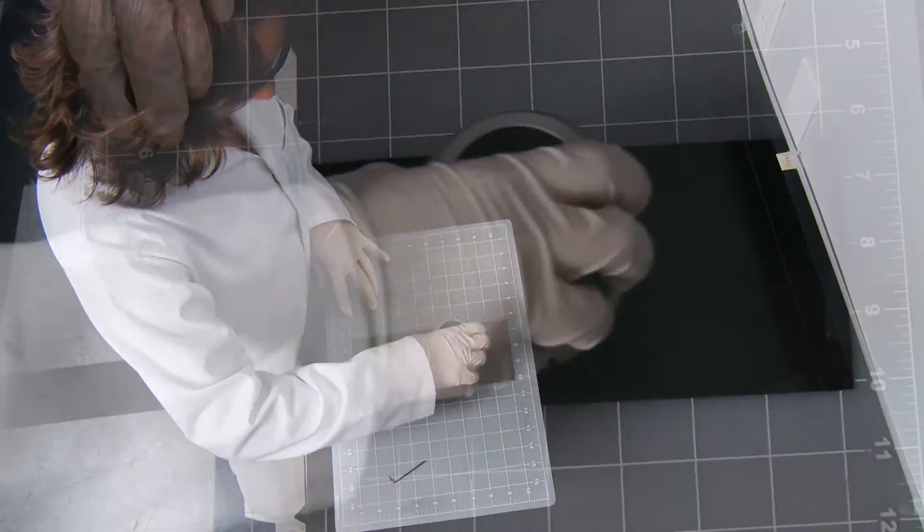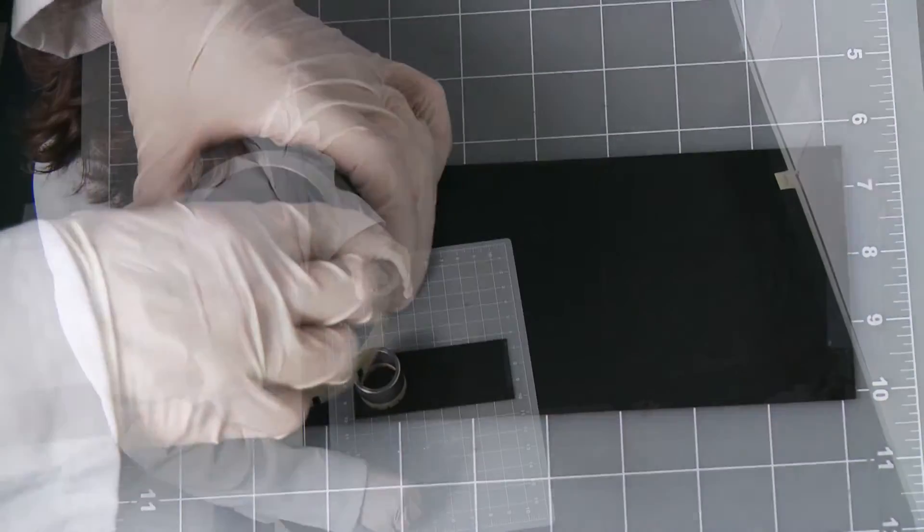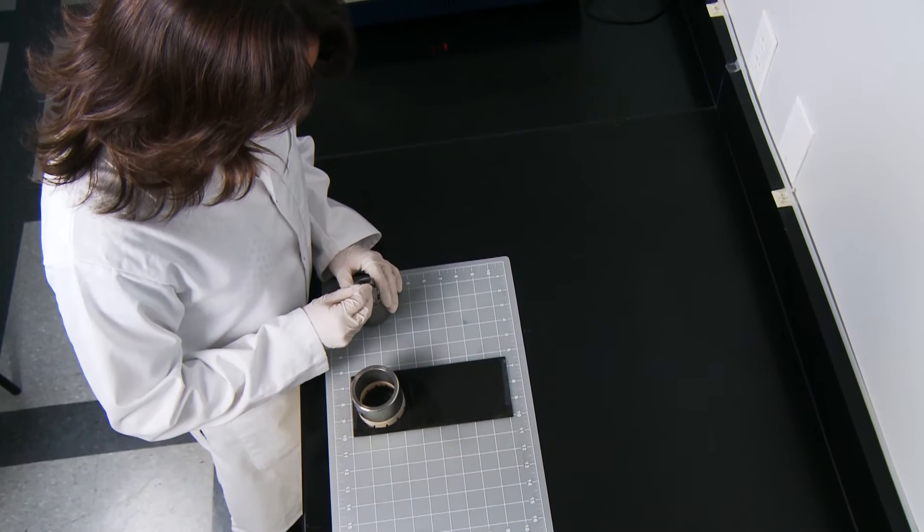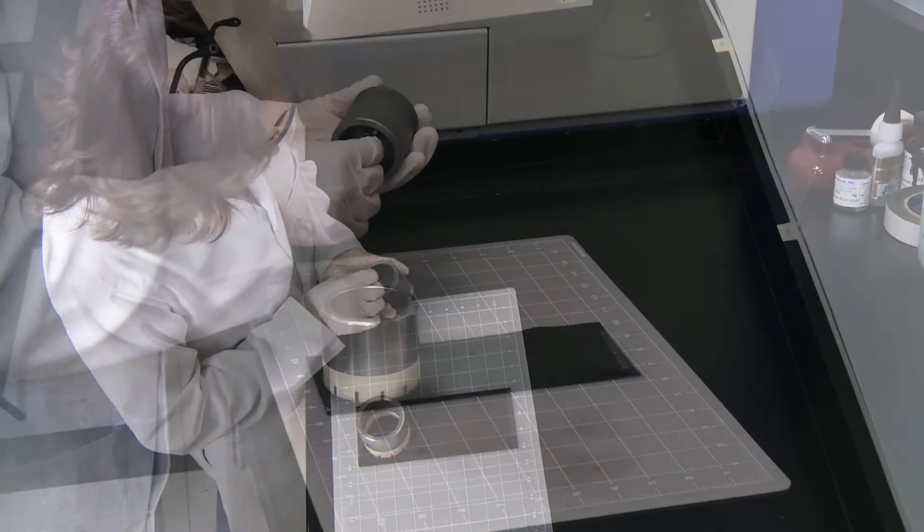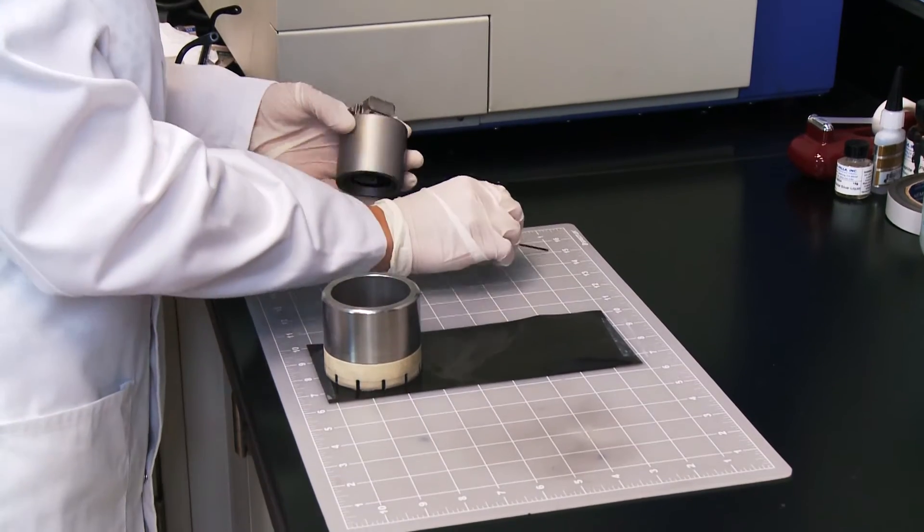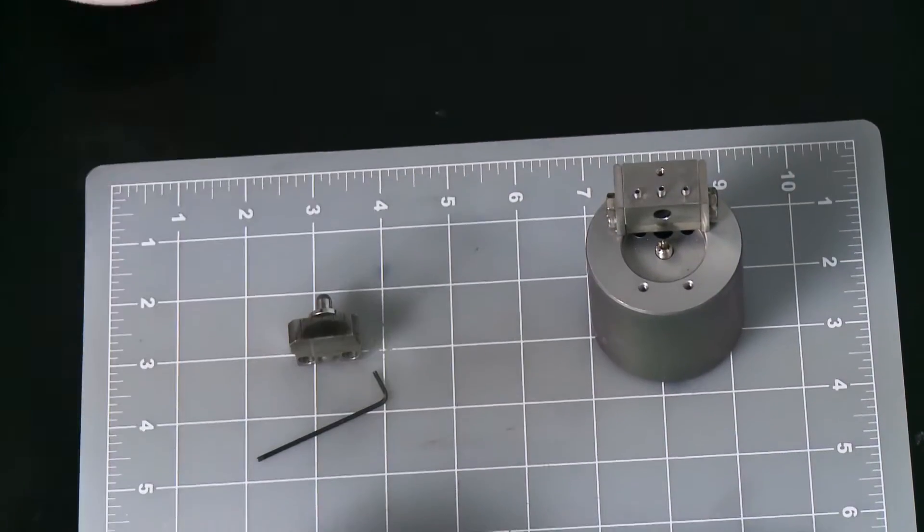To enhance end pointing precision, the same compatible sample mount holder that is used when polishing with the Maruto can be used for ion milling and also EM inspection. By eliminating the need to change mounts during preparation, milling, and from one instrument to the other, makes preparing cross sections with a specific area of interest more precise.